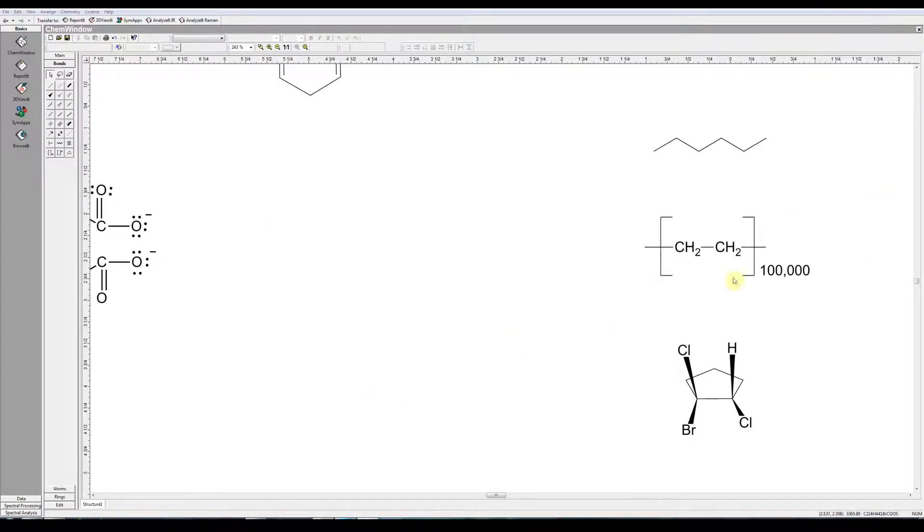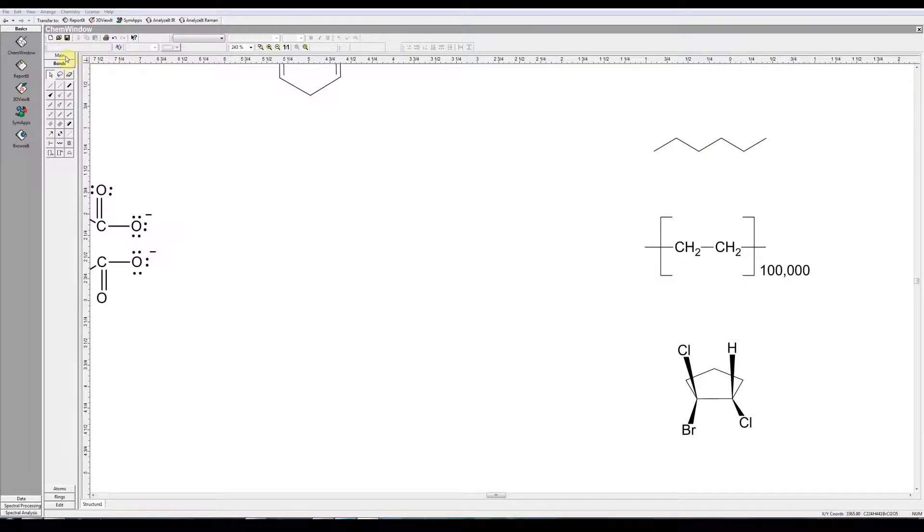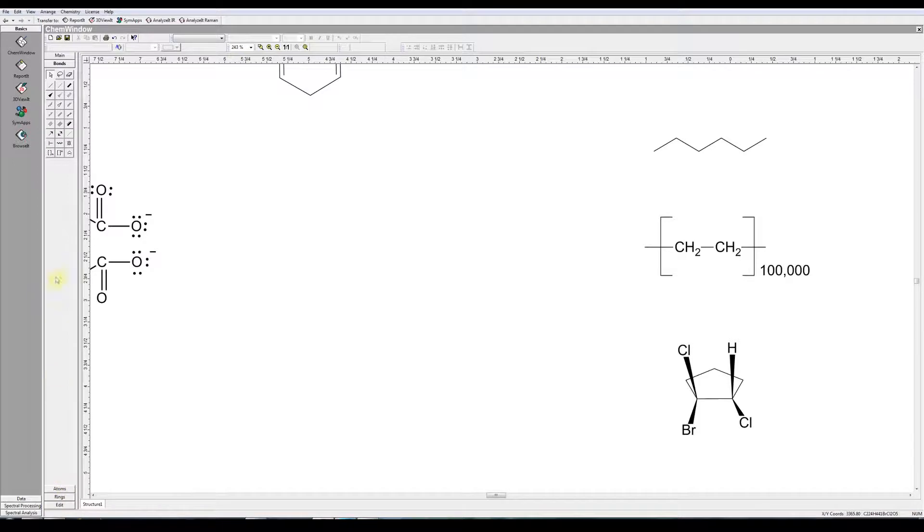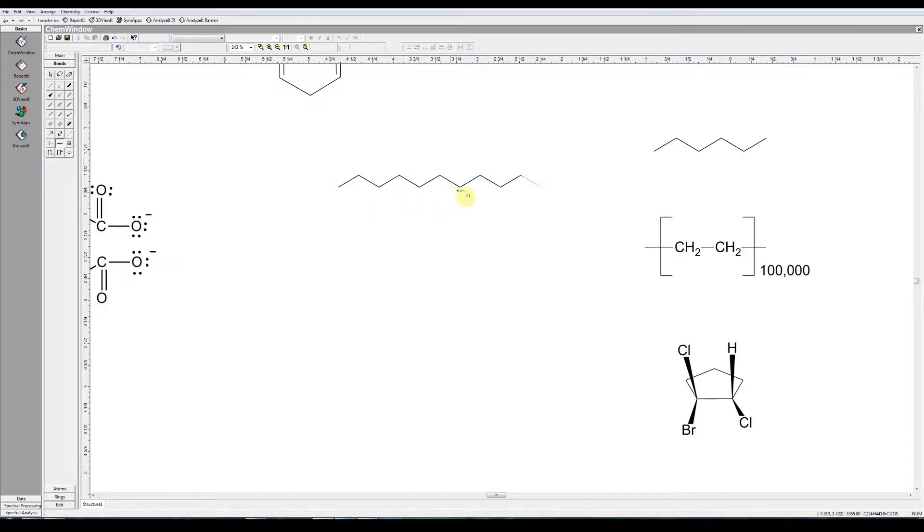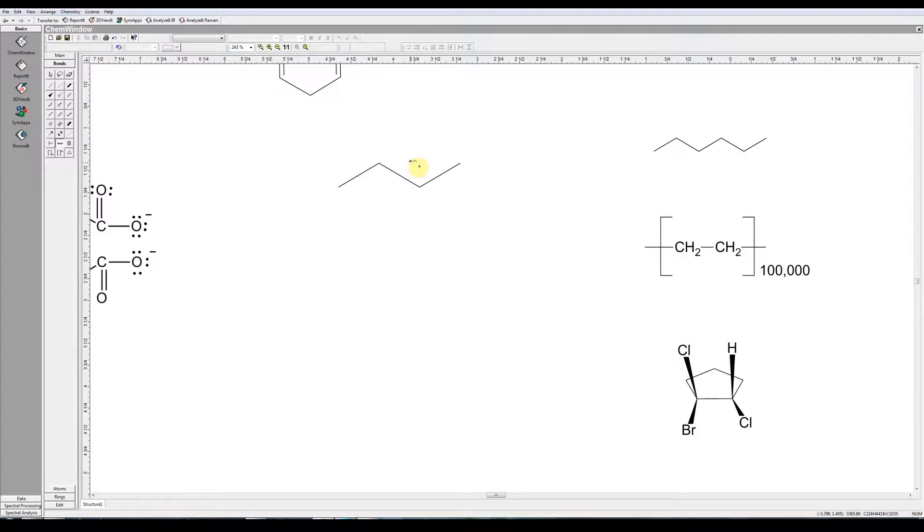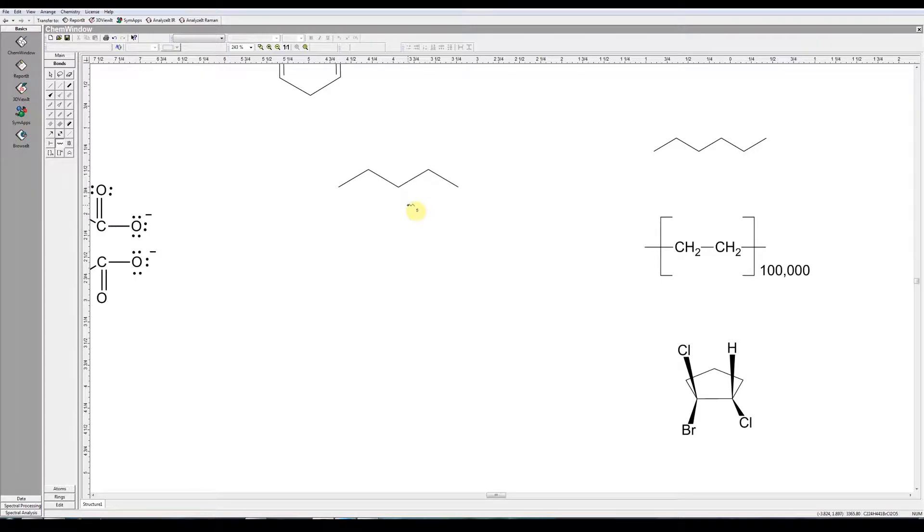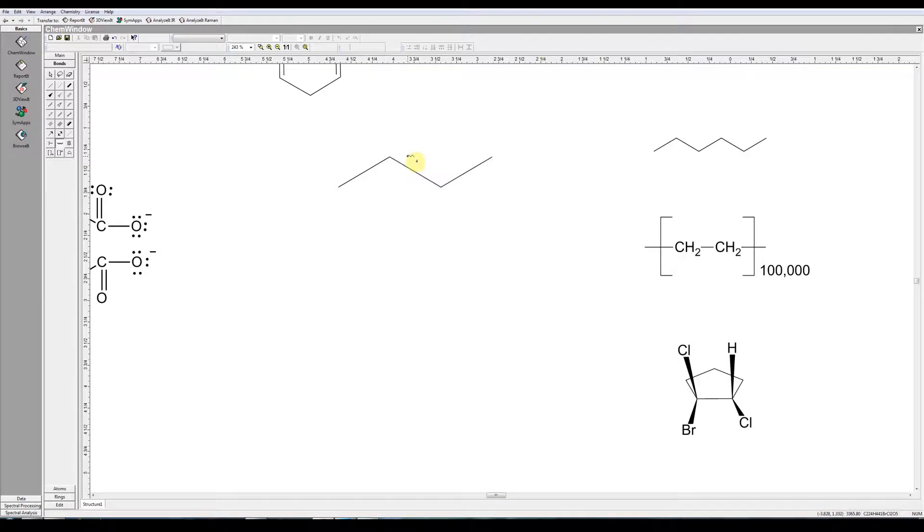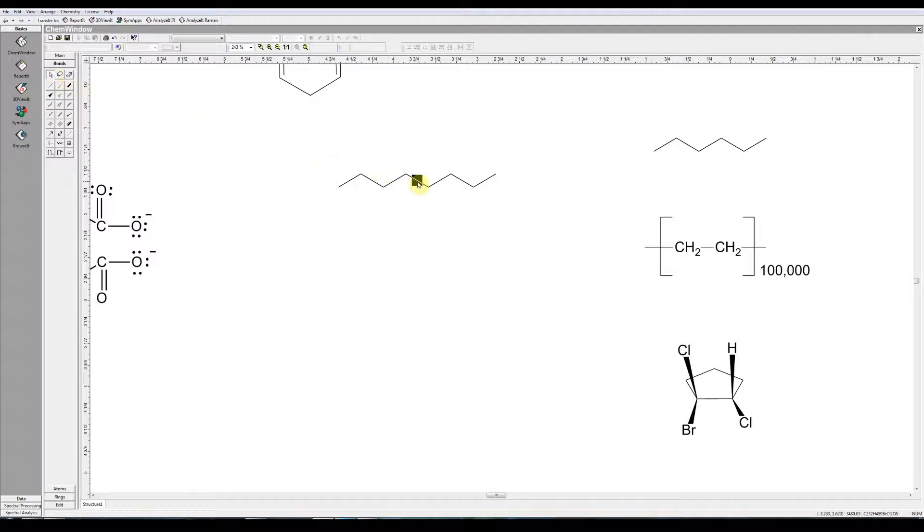Let's try drawing these. Here's a polymer chain. For that we can use the chain tool. It's on the bonding tool group. Just drag outwards. And notice it counts the number of bonds as you drag. Now if I hold down the shift key as I do that, I can move the cursor up to make longer bonds. Or move it down to make shorter bonds. And then when you go past the zero mark, it flips the other side. So whenever you feel it's about right, you're going to release that. Click until you see the dots and you can then move the whole structure.